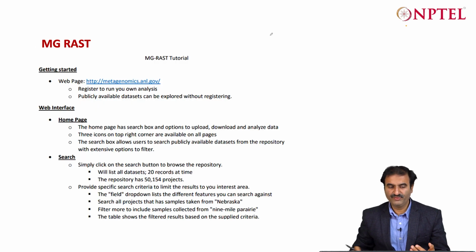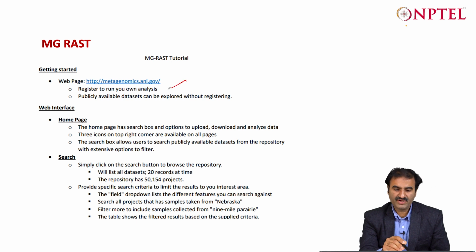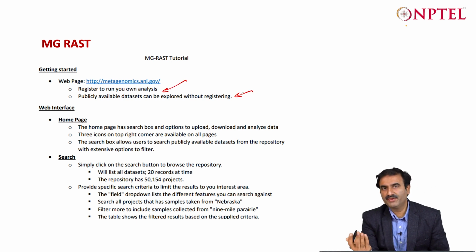It is free to use so far. You can register to run your services and also use the other publicly available pre-computed results to compare. For example, you are dealing with hot springs, so there could be other hot springs available over there, and you can quickly compare your data with publicly available data sets. Or you can keep your data private and do the analysis, and also do analysis standalone and then compare.